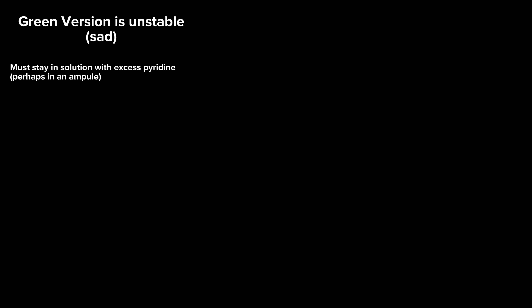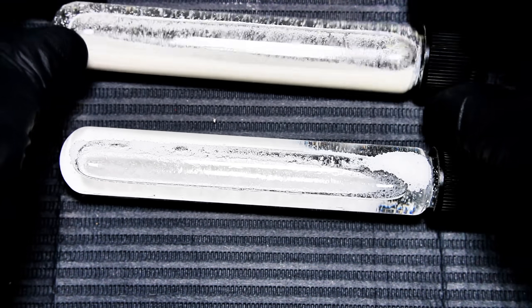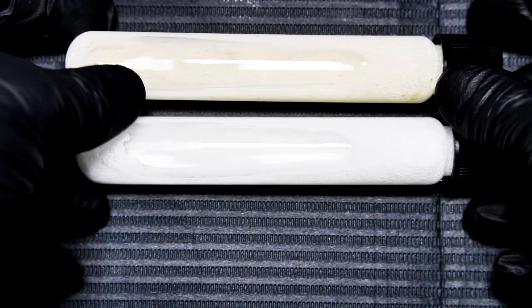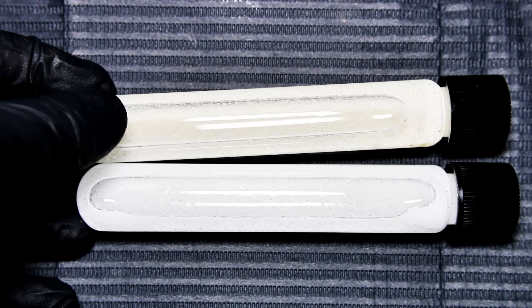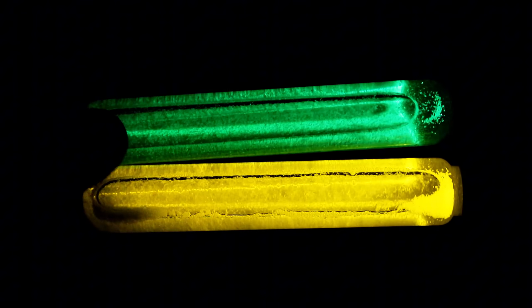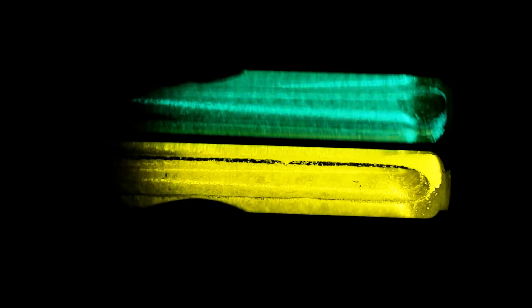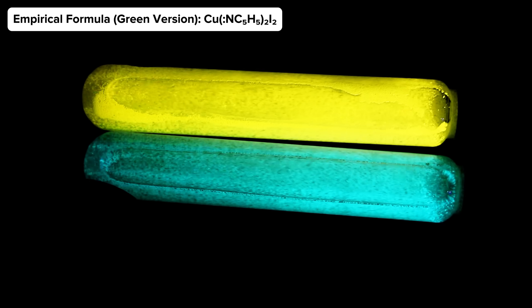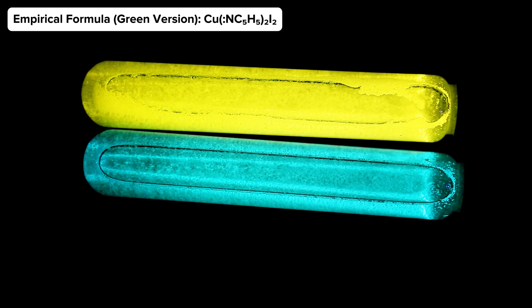This instability is due to a breakdown of the complex caused by a loss of pyridine, which can actually be prevented if the compound is stored in an ampule along with an excess of aqueous pyridine. Otherwise, the compound will slowly lose pyridine and break down into the yellow fluorescent version over time. The empirical formula represents a molar ratio of one part copper to two parts pyridine and two parts iodine.